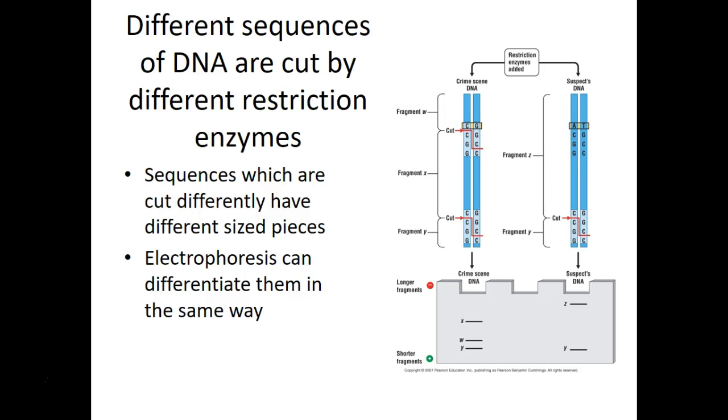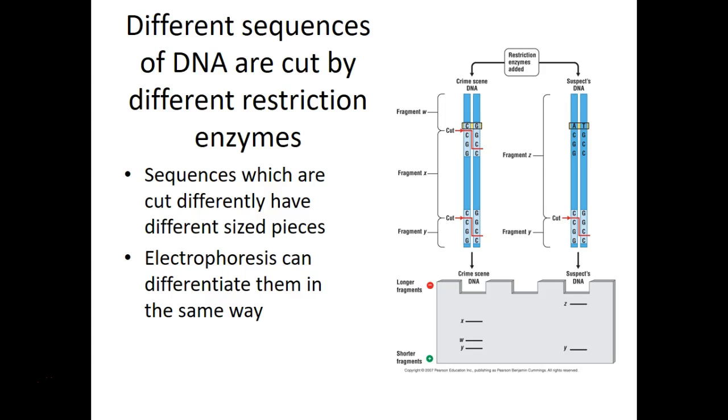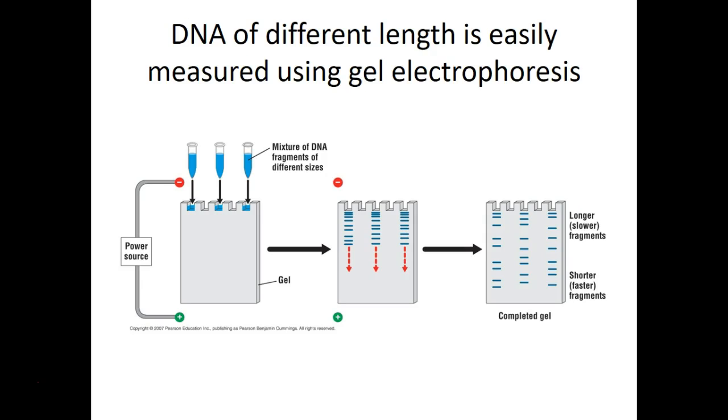And we can use restriction digestion and gel electrophoresis in combination in order to diagnose disease, genetic disease, in order to diagnose infectious disease by looking at bacterial DNA instead of human DNA, or to solve paternity disputes or whatever. So once we amplify DNA using PCR, we can analyze the amplified DNA using restriction enzymes and this technique called gel electrophoresis. DNA sequences of different length are easily measured using gel electrophoresis.